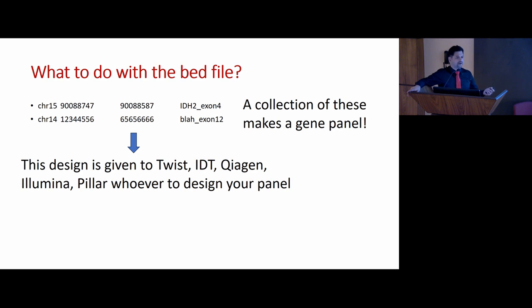You can say that I want to design only an assay for IDH R140Q, you download these coordinates, you basically run this through the genome with bedtools or something, and you can get all these bases out. And you can put this in Primer3 and use it to design an NGS assay. You can do that as well. But typically you want to do this for hundreds of genes with possibly thousands of exons, and it's better to use a bioinformatic process rather than to do it ad hoc.